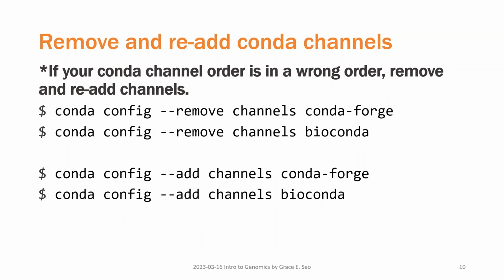In case you've added the Conda channel in the wrong order, you're seeing Conda Forge at the top instead of Bioconda, then you can also remove your channels and then re-add the channels.